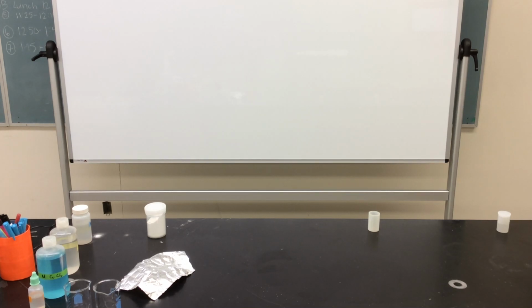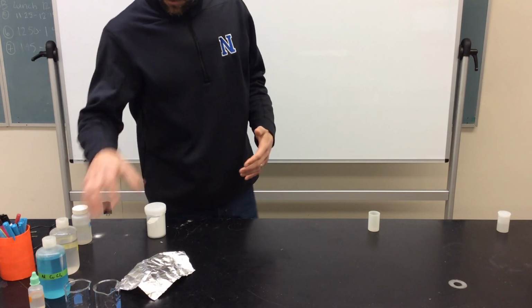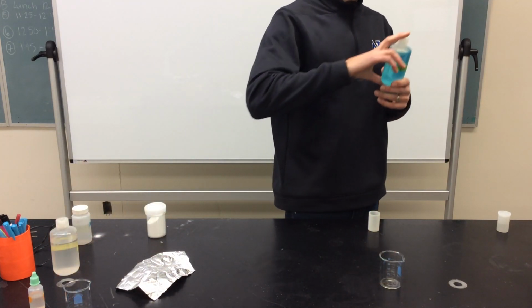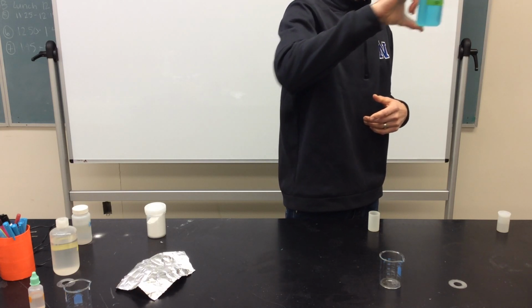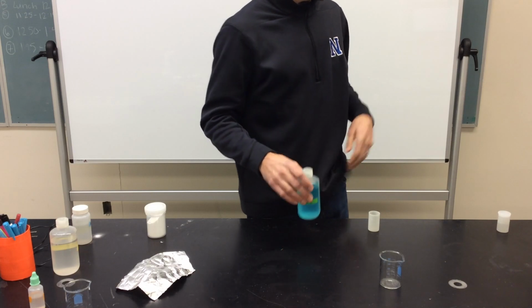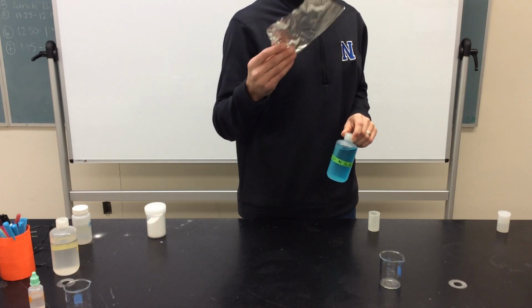So the first thing that we're going to do is look at a little reaction between a compound that we call copper chloride, which is this stuff right here, this nice bluish greenish liquid, and aluminum foil.